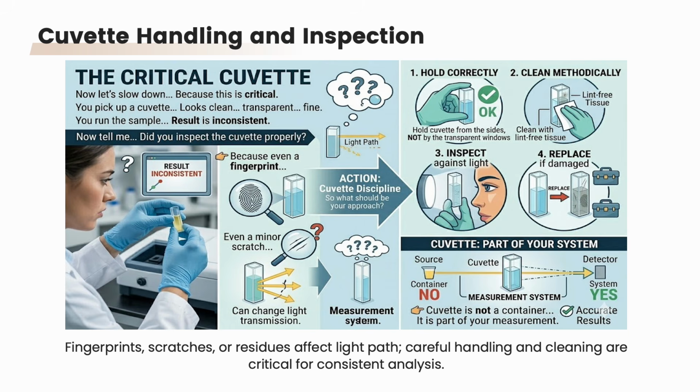So what should you do? Handle cuvettes carefully, hold them from the sides, clean them with lint-free tissue, inspect them against light and replace if damaged. Because in UV analysis, the cuvette is not just a container, it is a part of the measurement system.